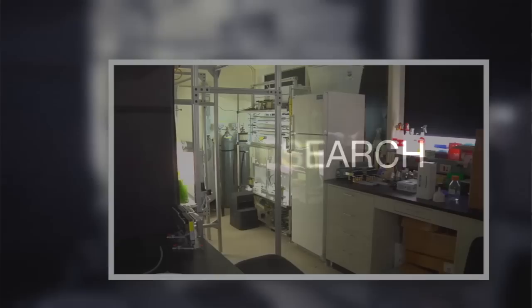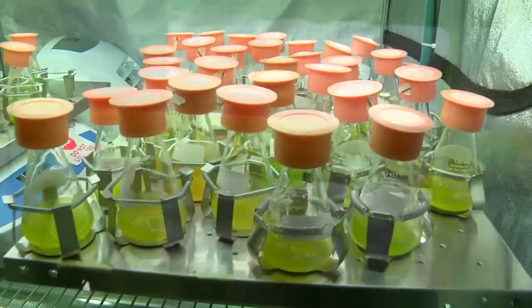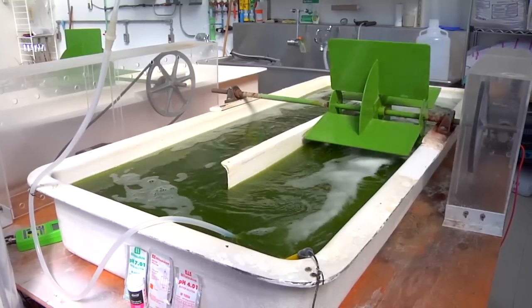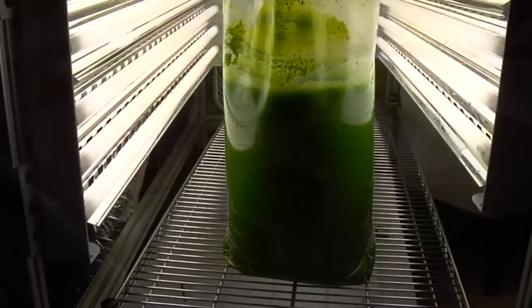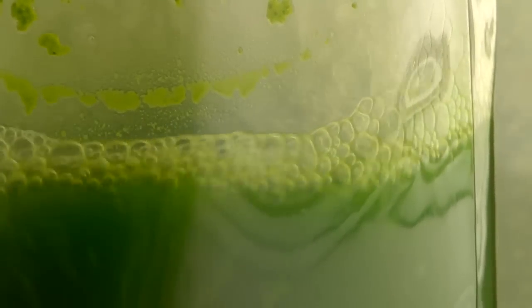This is the algae research lab. Algal biomass is rich in lipids, similar to vegetable oils, that can be extracted and used for biofuels. The National Bioenergy Center is analyzing the best conditions for growing algae and developing cost-effective strategies for production. It's really a combination of the engineering, looking at the entire process and putting together all the different unit operations that go in: how to grow the cells, how to harvest, extract, all of those things, to determine what the best process option looks like.